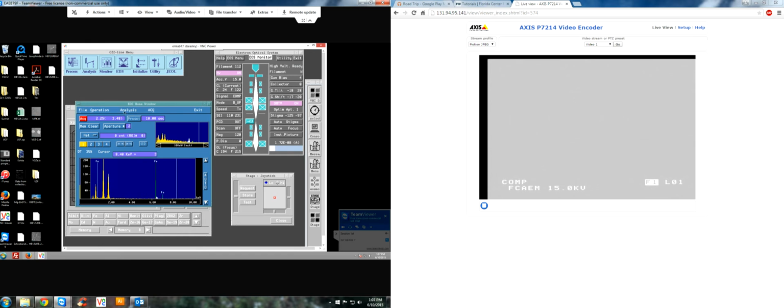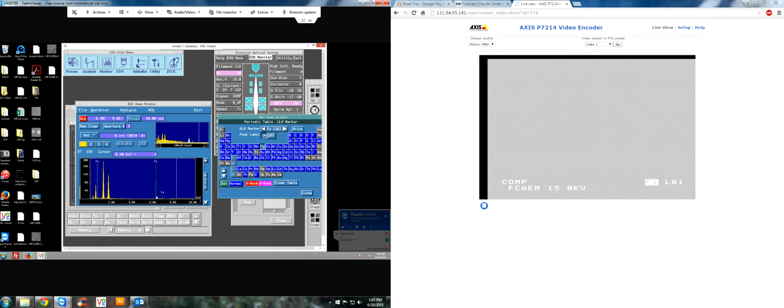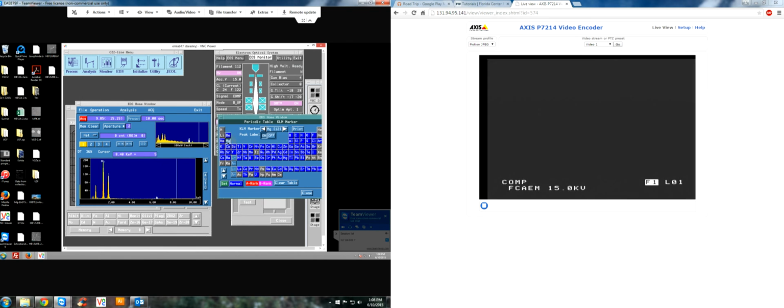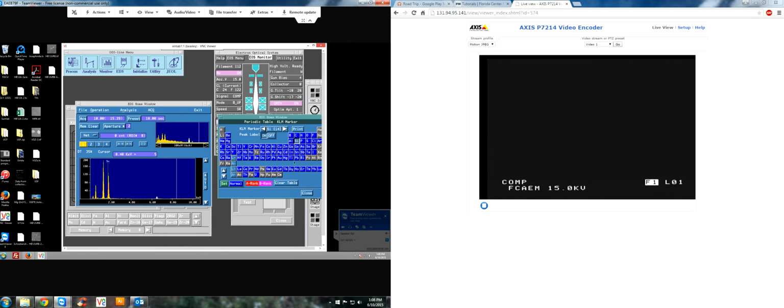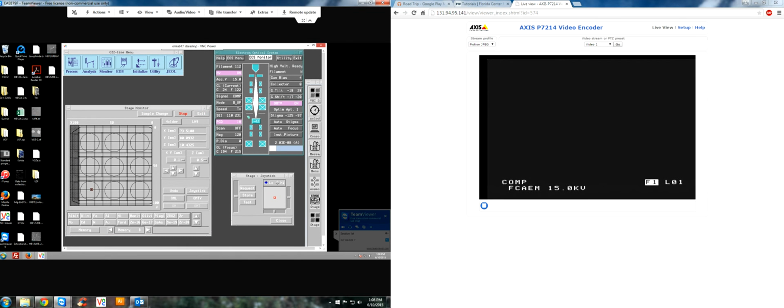Under operation periodic table, we should expect to find iron, magnesium, and silica. The iron energy lines are displayed, so that's iron right there. Let's see, magnesium, yep, and silica. So basically we used EDS just to confirm that that was an olivine phenocryst.